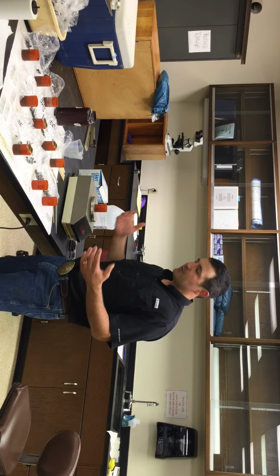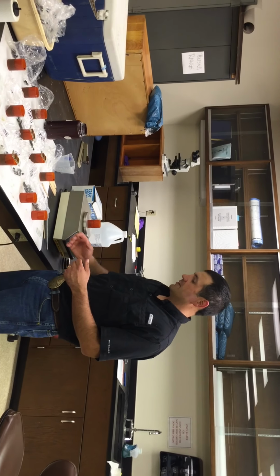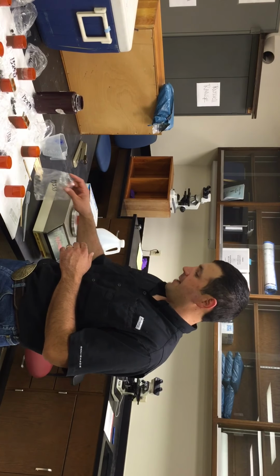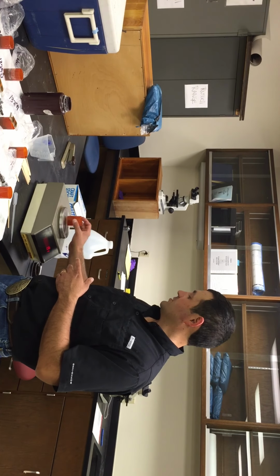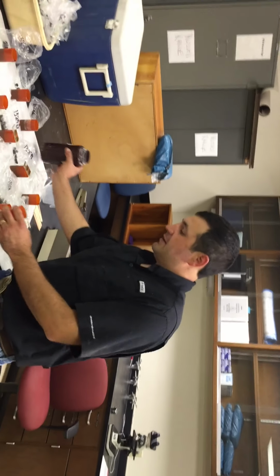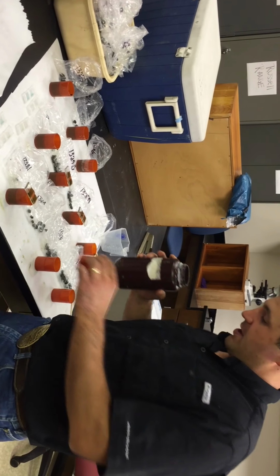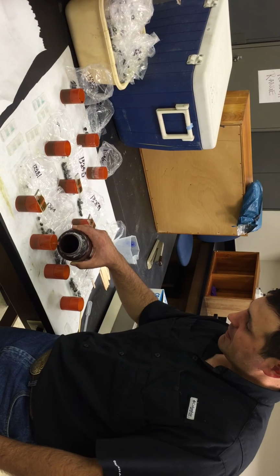Okay? So how do we do a fecal egg count? Well, I've got all this stuff out here, and I want to walk you through that process. So as you can see, we've got some baggies here with the individual samples. They're labeled with the animal's ID tag. And the first step is we're going to weigh out 2 grams of feces. So that's what I've got here in this cup, just some pellets. And then we're going to add some salt solution. Actually, 28 milliliters is the exact amount. I've got that marked here on this cup from previous work. We're going to add that in there.